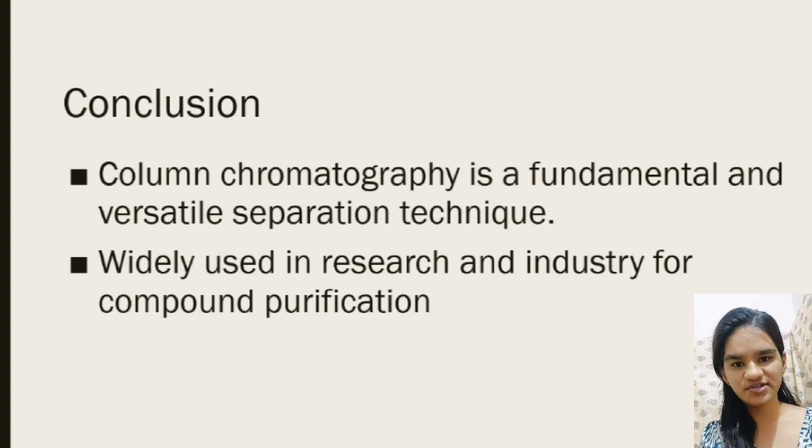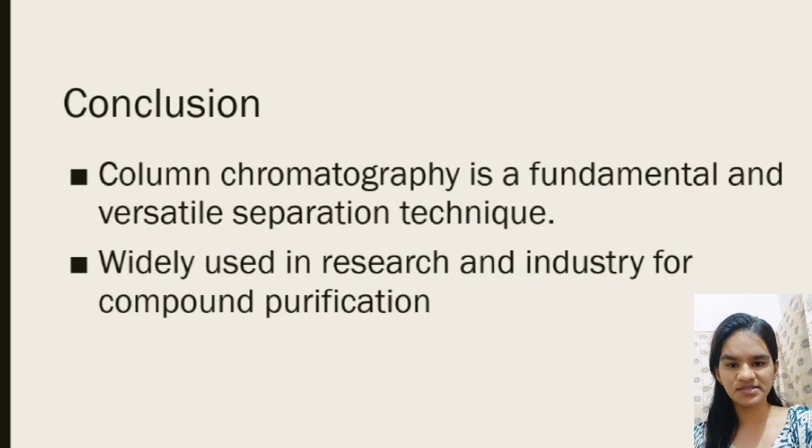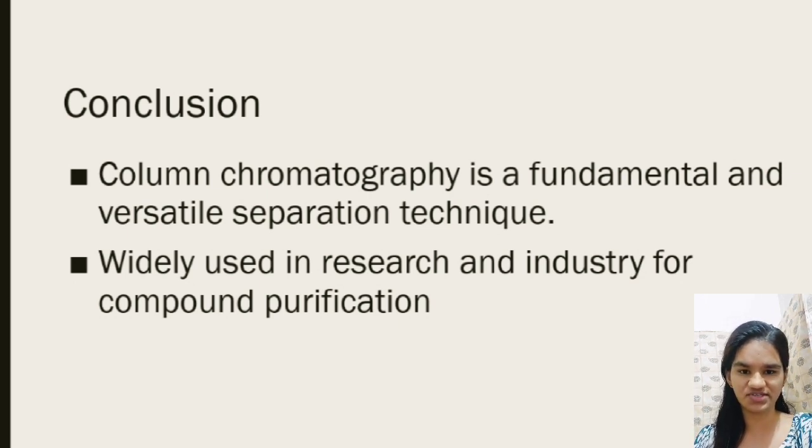Now the conclusion for column chromatography. Column chromatography is a fundamental and versatile separation technique, and it is widely used in industries and research centers for compound purification.